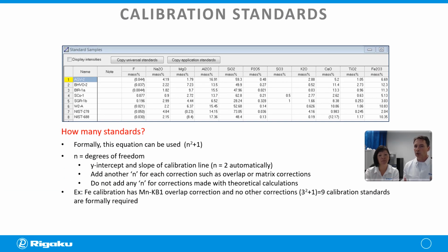So how do we do it? We'll show this again. We're going to go back, show you some different prep techniques. Then we're going to go on the machine and we're going to show you live how we actually do this, and we're going to set up a calibration with you.